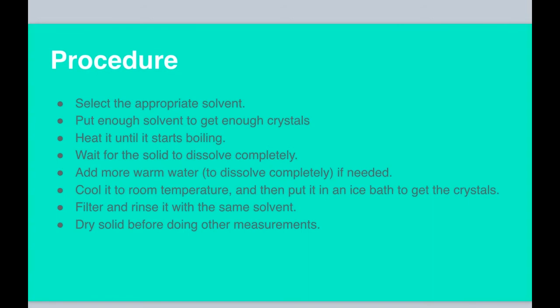As far as the crystals, we never want to put too much solvent, because then we wouldn't actually be able to get the crystals. So we just add a little bit as we go, and we stir it to see it dissolve. It has to be the right proportion.